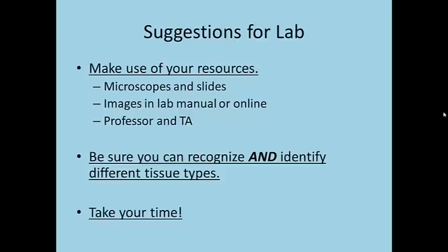And finally, take your time. 3 hours seems like a long time in lab, but it'll go by pretty quickly. There's going to be a lot to go over. So take a breather, take your time, make sure you're making use of, especially the microscopes and the slides, which you probably don't have at home. So you only have a limited amount of time to look at those. So that's one of your resources.